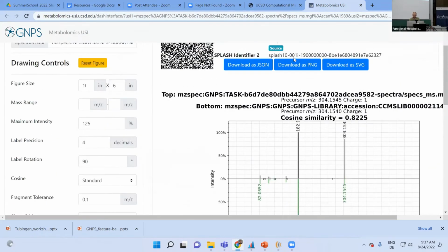Oh, the scores. Yes, good question. Good that we didn't miss it. The thing is, this interface uses different filtering and also a different implementation than GNPS molecular networking. So it's kind of sad that we don't get the same scores, but here it's actually processed on demand.